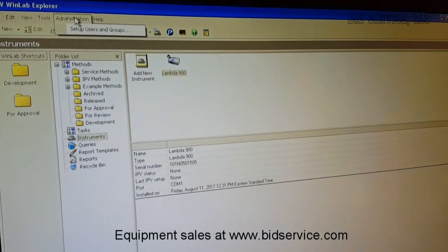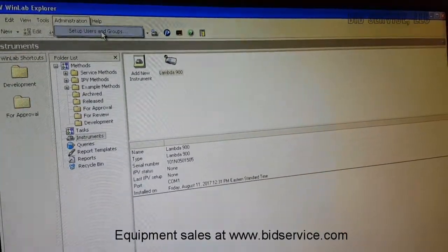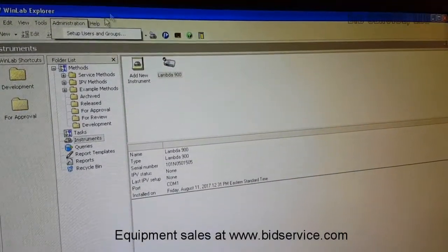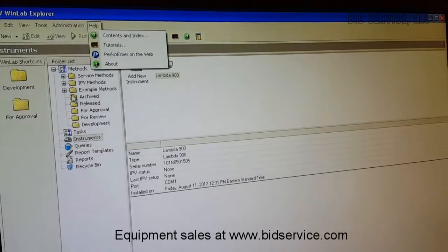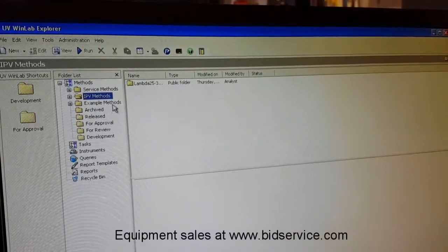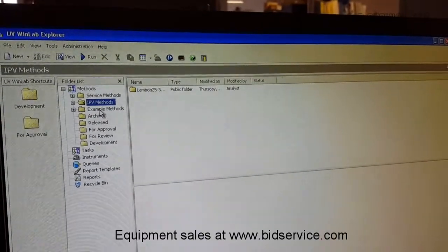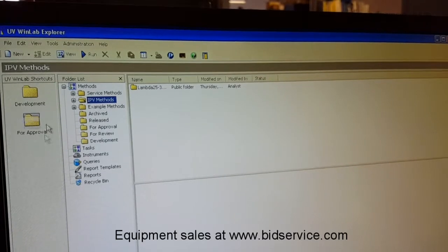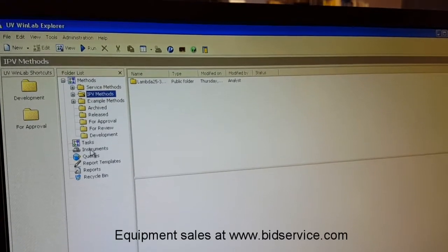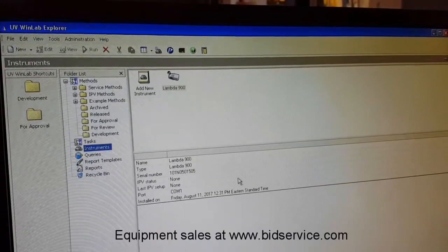And in this, there are also various sets of users and groups that can be created on this machine, to keep information about various users, and their data can be stored in various folders.